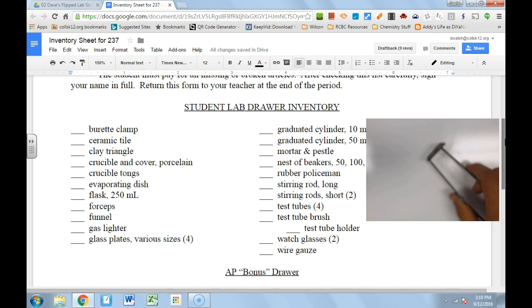Getting really exciting — we have our gas lighter. We're going to use this tool to light a Bunsen burner. When you squeeze it, it creates a spark that is sufficient to light the fuel of a Bunsen burner.